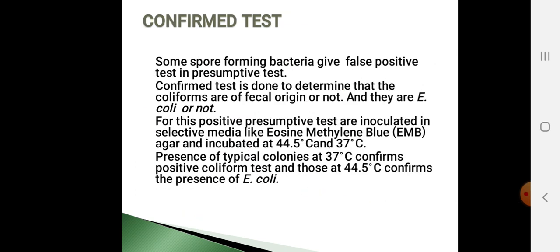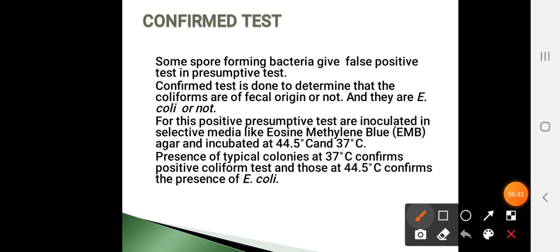The next one is the confirmed test. Some spore-forming bacteria give a false positive result in the presumptive test, so we carry this out further by the confirmed test.